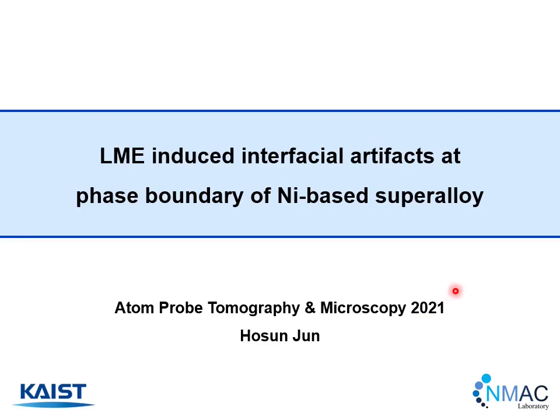Today I'm going to report on local magnification-induced interfacial artifacts at phase boundaries in nickel-based superalloys. Let's start the presentation.